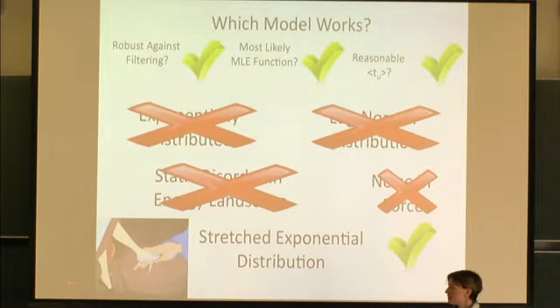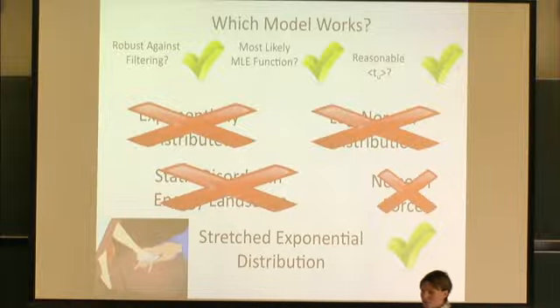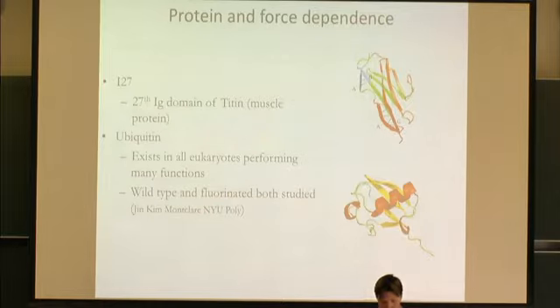So if the shoe fits, you would think that's the end of the story, but the problem is a little bit that the stretched exponential doesn't have a very intuitive and interesting physics that we can really apply to the proteins, and it hasn't been published by others with NMR data or something else to support. Why would you see it? Is there anomalous diffusion? Is the protein subdiffusive? Is it because there's lots of different states? It opens more questions than it answers if it were to be true. So how far is it from being a regular exponential? I'll show you that in just a sec.